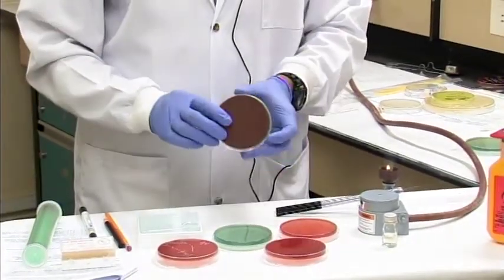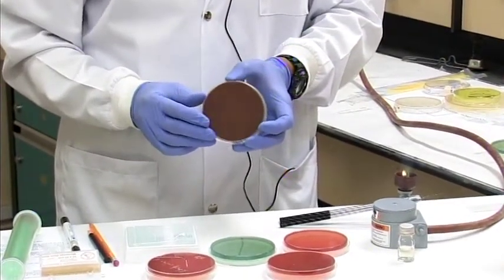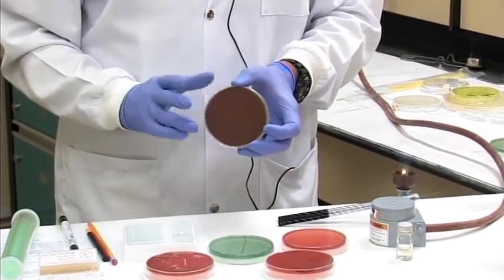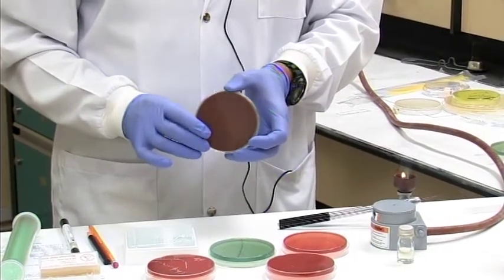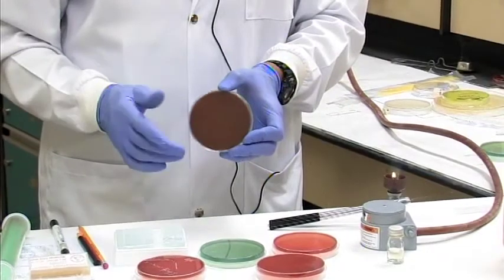And also we have a nice brown agar called chocolate agar used for fastidious bacteria like Neisseria, Haemophilus, and so on. These chocolate plates need to go under special atmospheric conditions. Carbon dioxide, about 5 to 10% carbon dioxide, which is achieved in either a candle jar or a CO2 incubator.